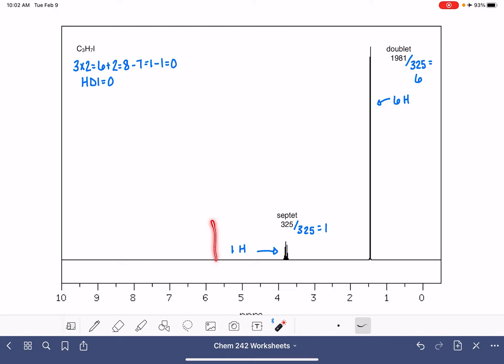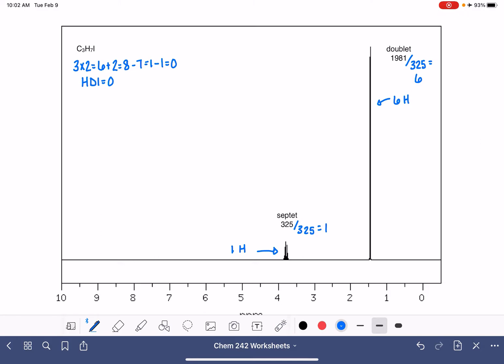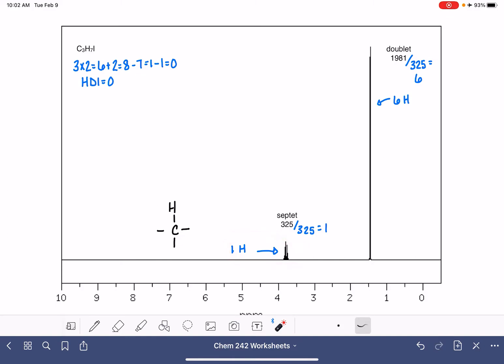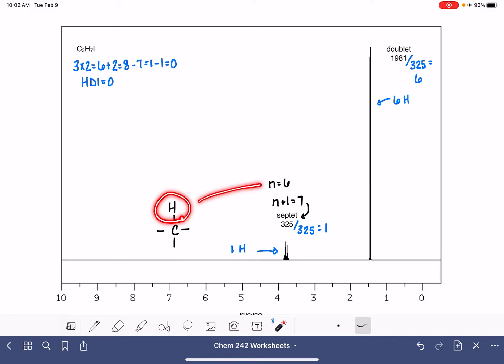Now we're going to try to draw a fragment consistent with the integral of one hydrogen and the splitting, which is a septet. So I'm going to begin by drawing the one hydrogen. That one hydrogen means we have one hydrogen atom with no other equivalent hydrogen atoms. On the carbon atom holding this hydrogen, there are no other hydrogens attached. This fragment corresponds to this hydrogen. Now this hydrogen is split into a septet, so n plus 1 equals 7, meaning n equals 6. For this hydrogen atom, n is 6.